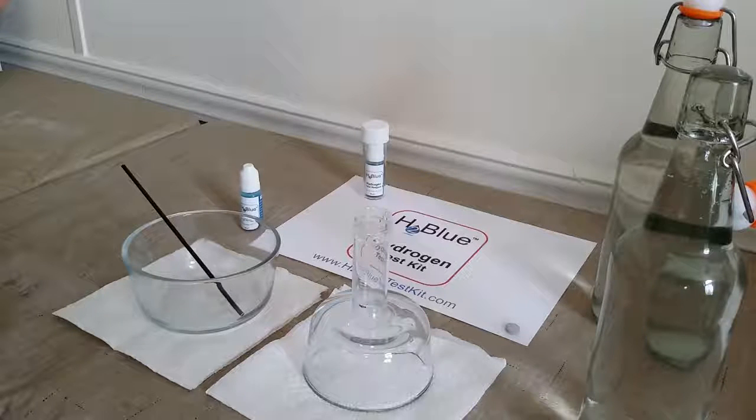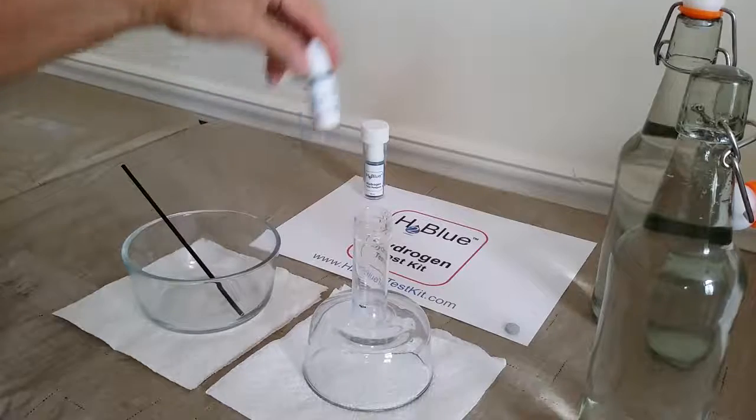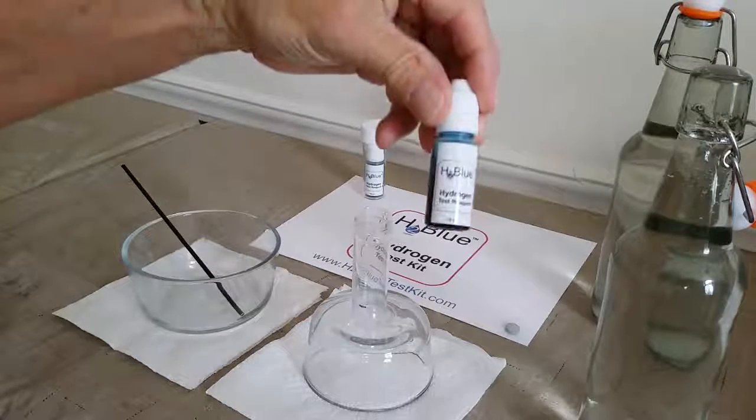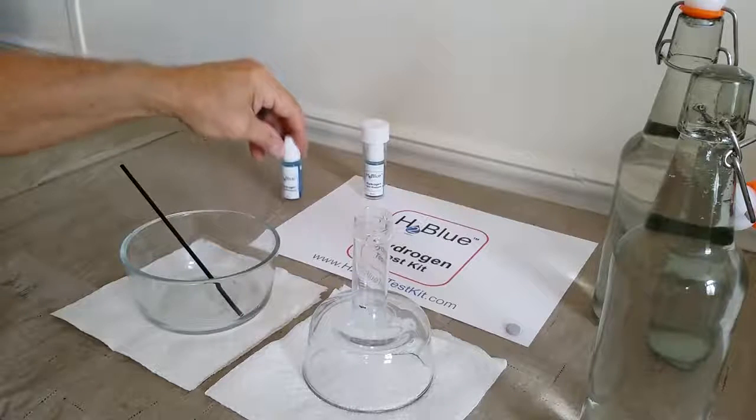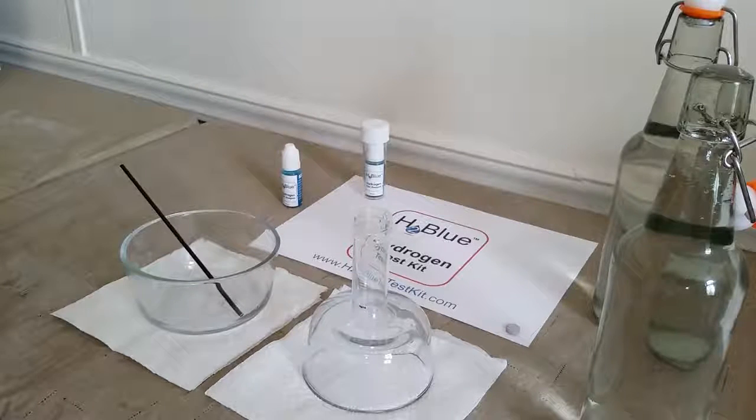Welcome back to our tutorial on how to use the H2Blue hydrogen test reagent to test your water for dissolved molecular hydrogen gas. In part 1, we went over the fundamentals of H2Blue and titration, a little bit of the chemistry, and now in this video I want to actually show you how to perform an H2Blue measurement.